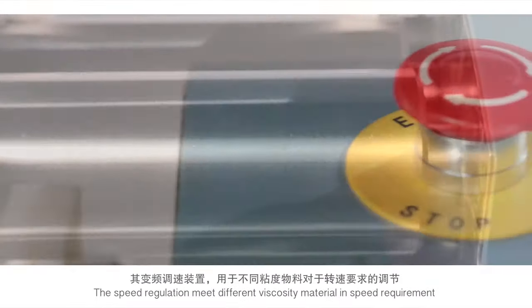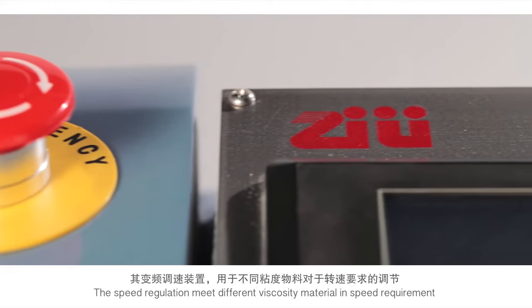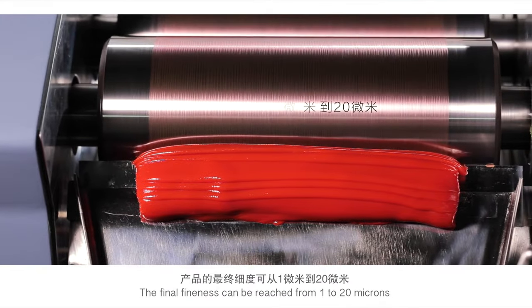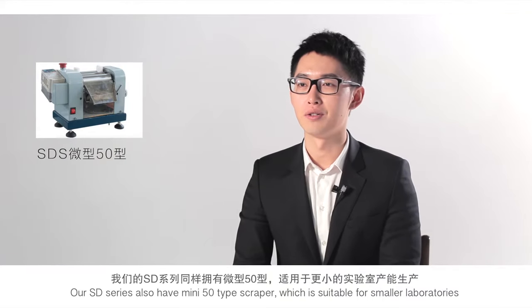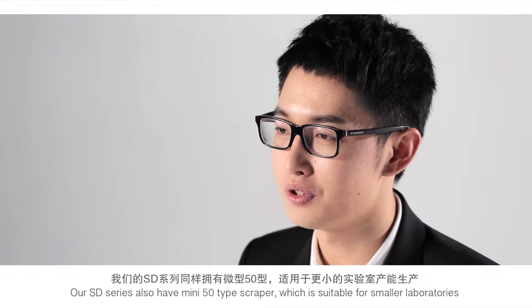The speed regulation meets different viscosity material speed requirements. The spring tension scrapper holder is more effective in ensuring proper discharge. The finer fineness achievable ranges from 1 to 20 microns. Our SD series also features a mini 50 type scrapper, which is suitable for small laboratories.